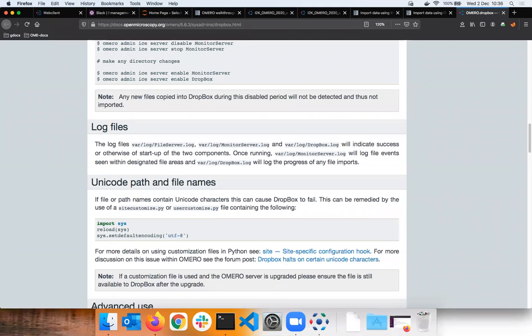The top link, the import link, the last link I put, has the various options we discussed today, which are the import from the user environment, the in-place import, the Dropbox option, etc. Just try to read the OMERO guides. This should be readable for you, Sylvia. Then ask somebody who knows more about IT to read that as well and jump from there. There are links to more serious documentation.